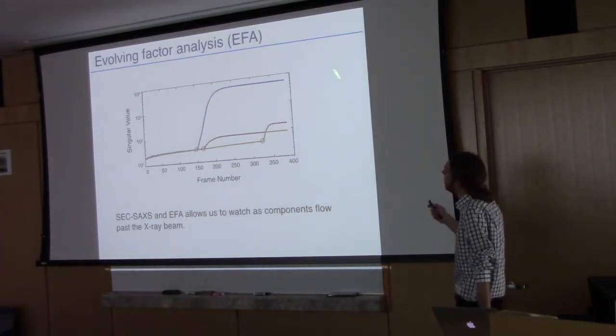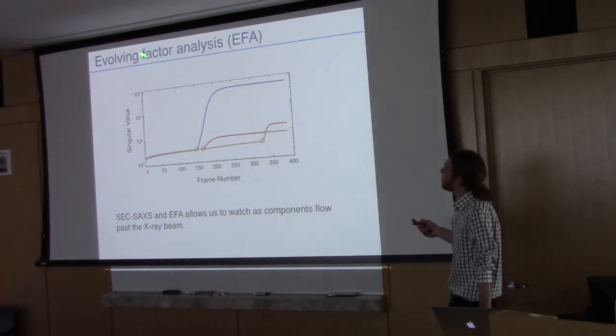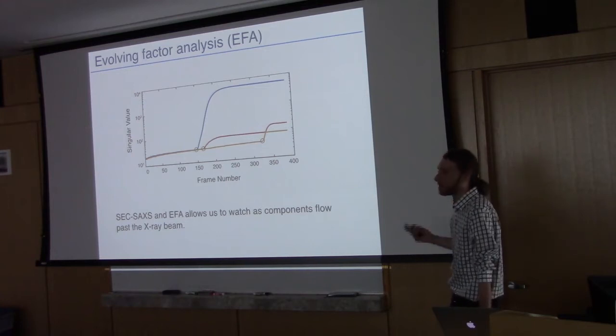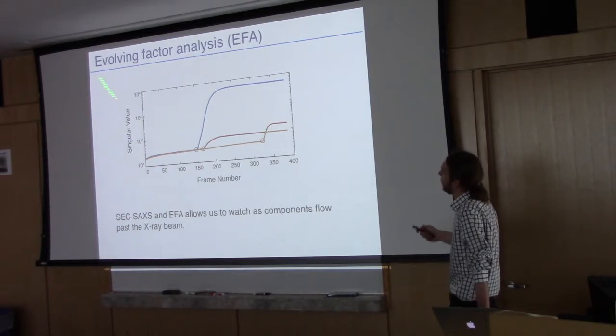The technique we developed for SAXS is actually borrowed from an earlier chromatographic technique that was applied to absorption. What do they call it? Chemometrics. It's kind of an old field, but basically it's not using SAXS, it's coupling other techniques to chromatography that have multiple observables.